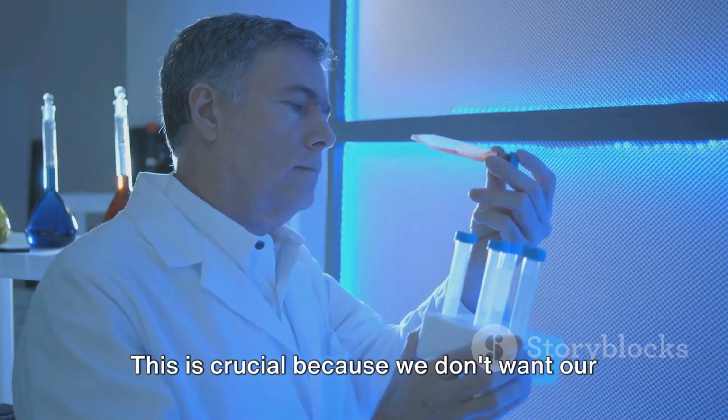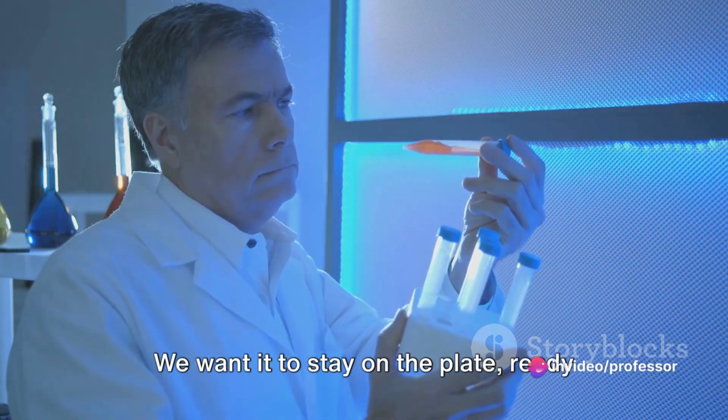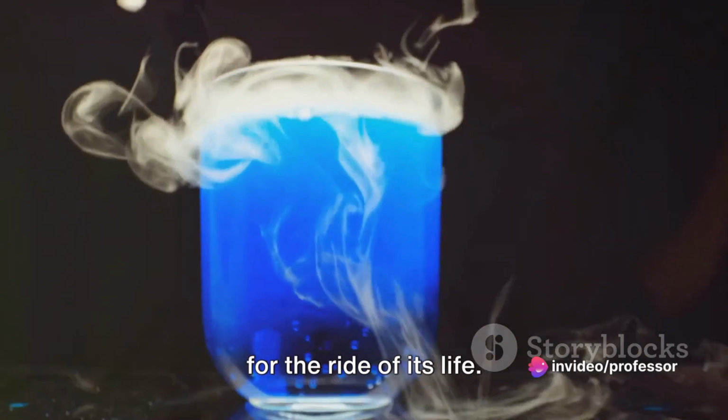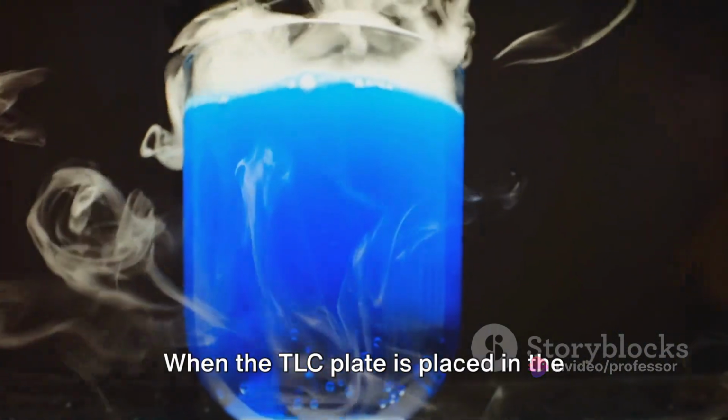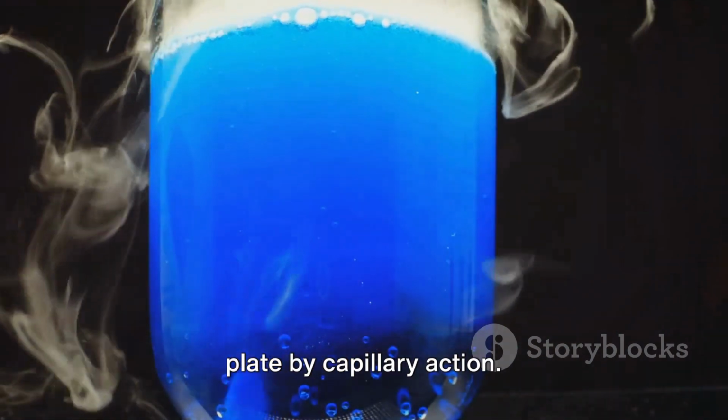This is crucial because we don't want our sample to dissolve into the solvent. We want it to stay on the plate, ready for the ride of its life. When the TLC plate is placed in the solvent, it begins to ascend the plate by capillary action.